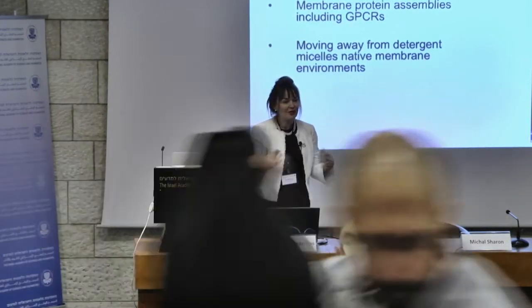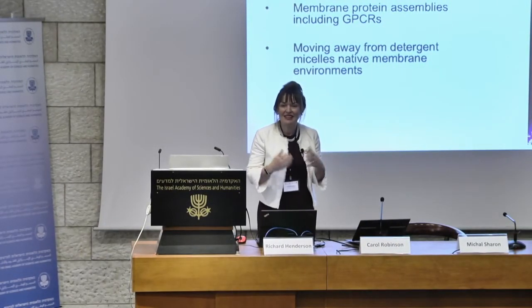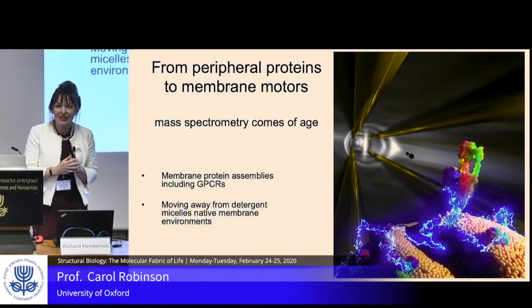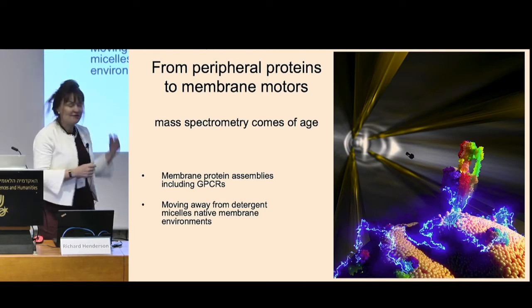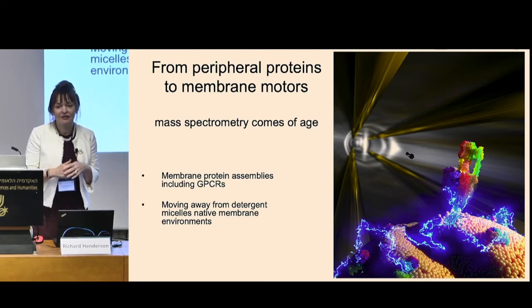I'm not going to assume that you necessarily know too much about mass spectrometry, so I'm going to start from quite a basic level, tell you a little bit about the history of where we started and very recent results of ejecting complexes directly from the native environments.